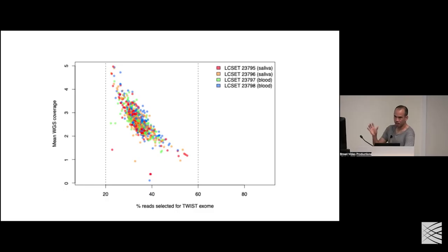We're giving you the deep enough exome that we're asking for. You're getting a low pass whole genome as well. Some samples do better than others, and this is something you may want to look at downstream, to see just how much your low pass coverage is doing relative to, say, the imputation performance. That might not be intuitive about this product, but this is how it works.